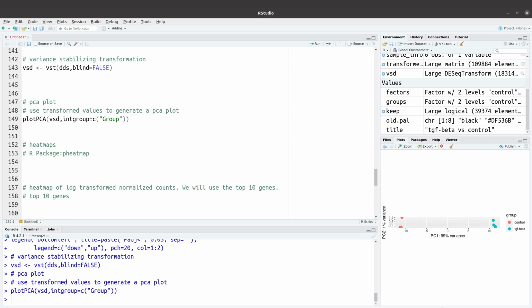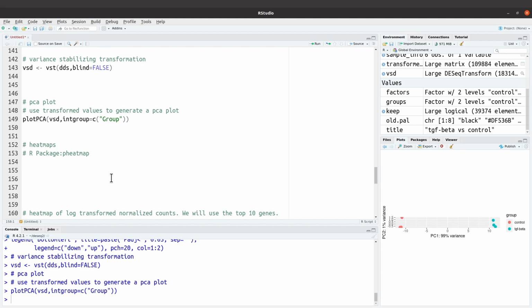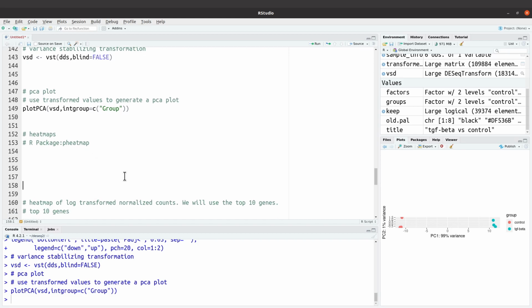So when I checked online, the suggestion I got was that I should extract the PCA values and then plot with ggplot. I should manually plot with ggplot. So if you also get something similar, then extract the PCA values and then plot using ggplot. Okay, that will help you sort it out. I'll make another tutorial later to demonstrate that, but for now I'll proceed with the next activity. If you also have any challenges, let me know and then we can have a session together. Okay, now let's move on to the next activity, and that is to generate the heat map.